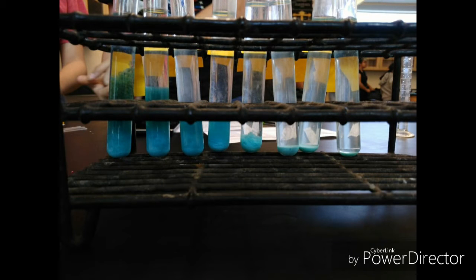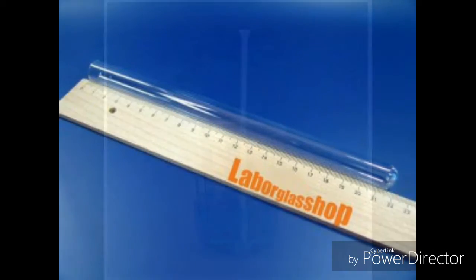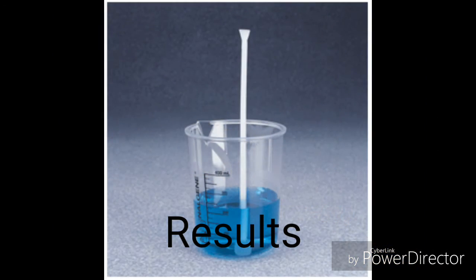After that, we filled the rest of each test tube with water so that each test tube had a solution of 13 milliliters. Then we mixed the solution and waited for the precipitate to form. After making observations of the precipitate, we grabbed the ruler and measured the height of the precipitate in millimeters. After waiting 15 minutes, we first found the balanced equation of the reactants and products, and then waited for the reaction to take place.